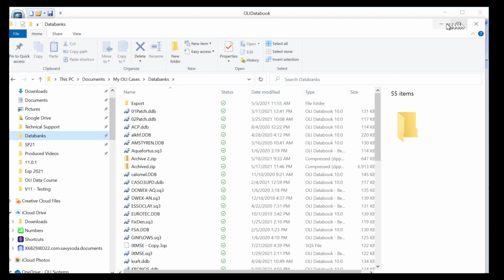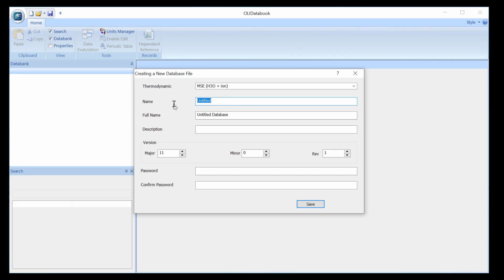For this particular example, since it is a special database, we're going to call it user 01 as our database. And the actual name could be, this is a user database for the on the video short course. And you can give even more data here. You should also give it a version number. It auto defaults to the current build of the software, which is 11.0.1. But if you wanted to have multiple versions for that, you can. We're going to use the default here.